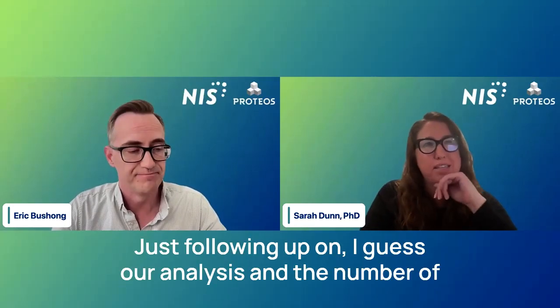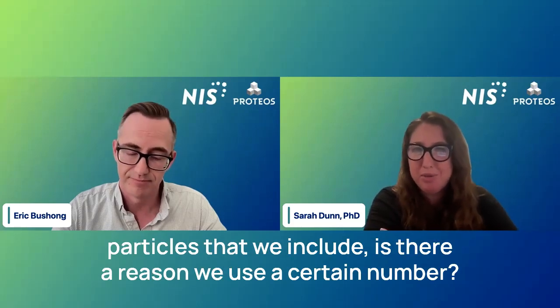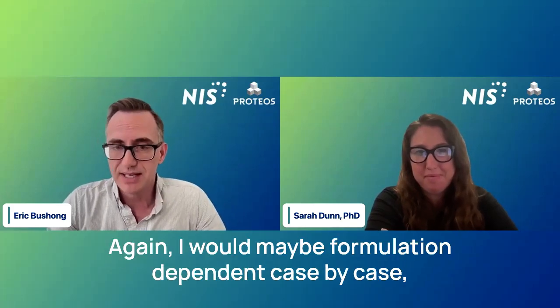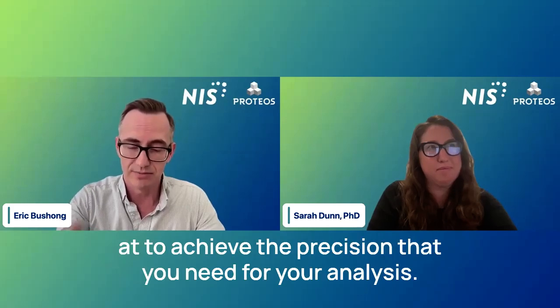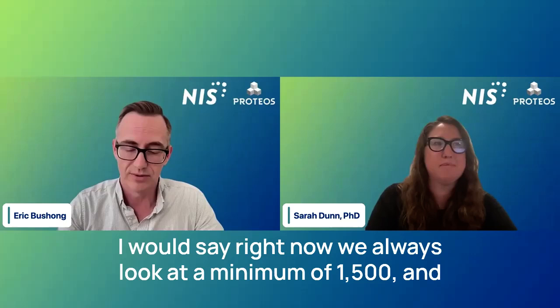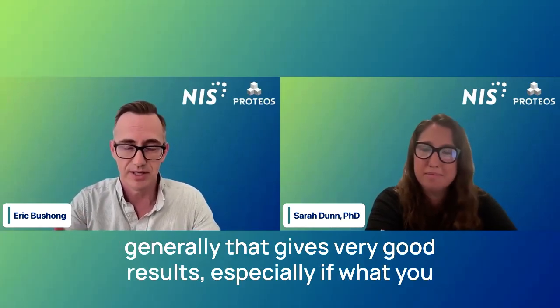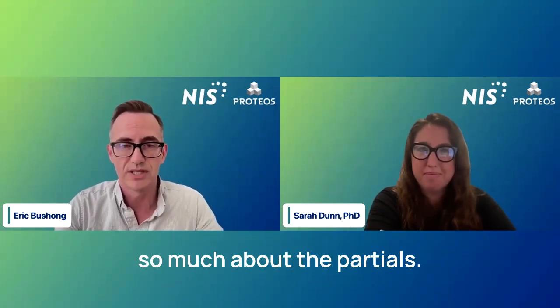Just following up on our analysis and the number of particles that we include: is there a reason we use a certain number? Well, I don't know if it's established yet. Again, that would be formulation dependent, case by case, depending on how many particles we need to look at to achieve the precision that you need for your analysis. I would say right now we always look at a minimum of 1,500. Generally that gives very good results, especially if what you mostly care about is empty and full, and you're not worried so much about the partials.